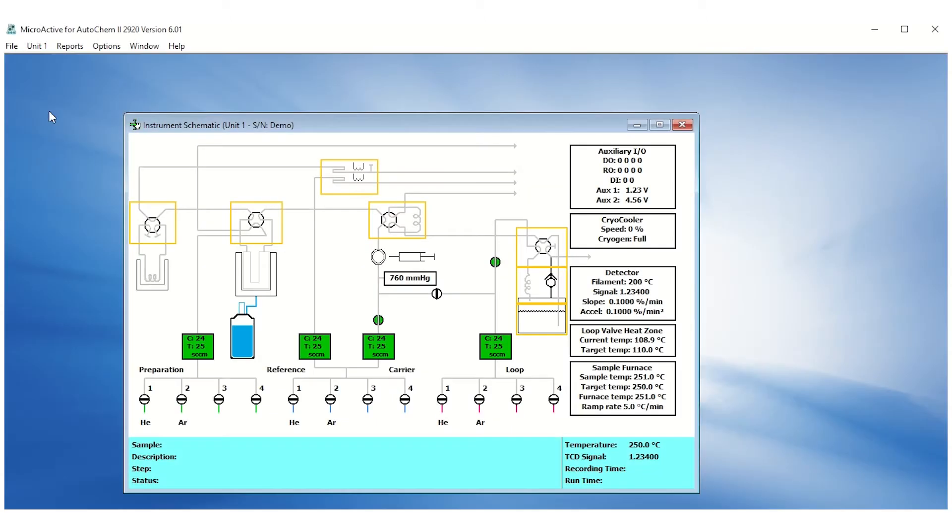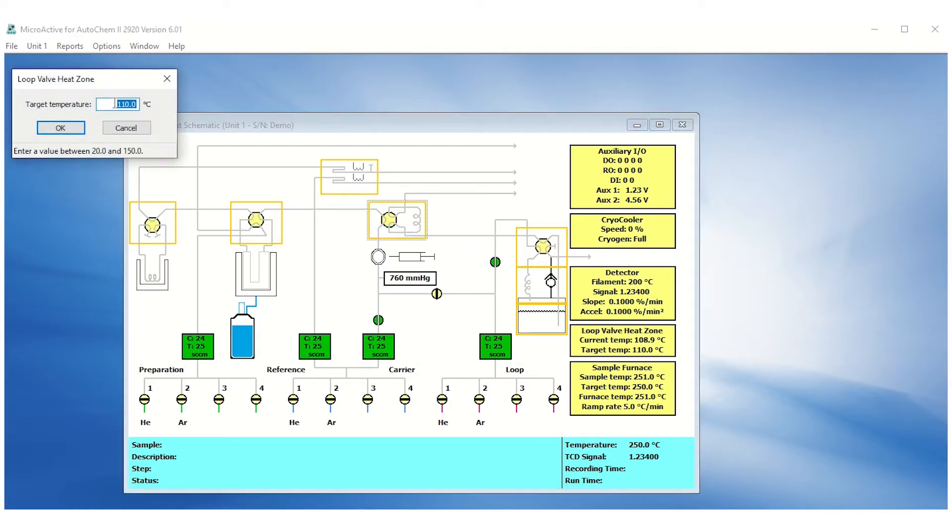To begin, go to unit, enable manual control, right-click the loop valve heat zone, click set temperature, enter 20 Celsius for the target temperature, and then press OK.